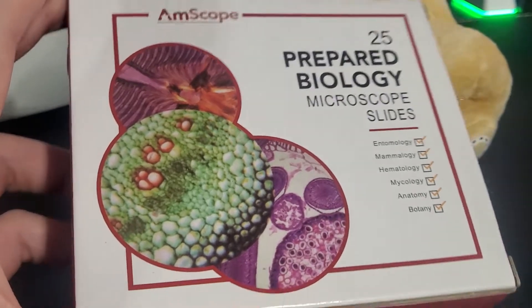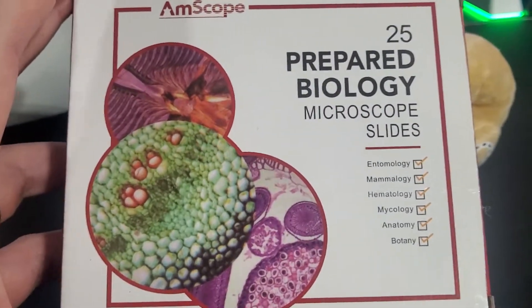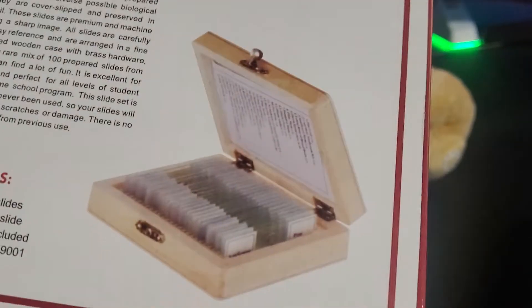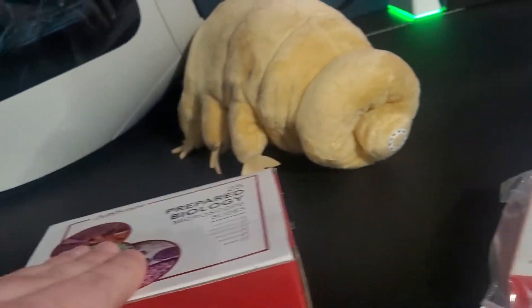We've got the prepared biology microscope slides right here. You get 25 of them and these are pre-created slides that you put in your microscope and view. There's all sorts of cool stuff on here — definitely recommend those.